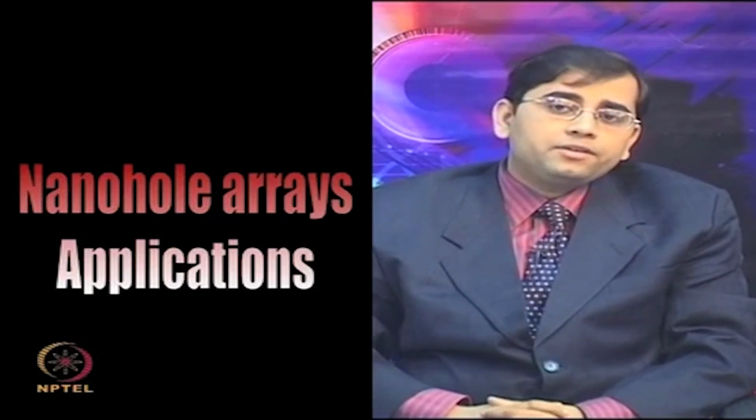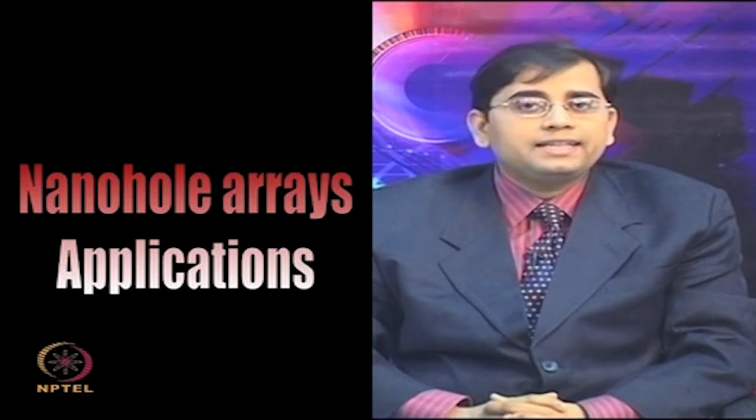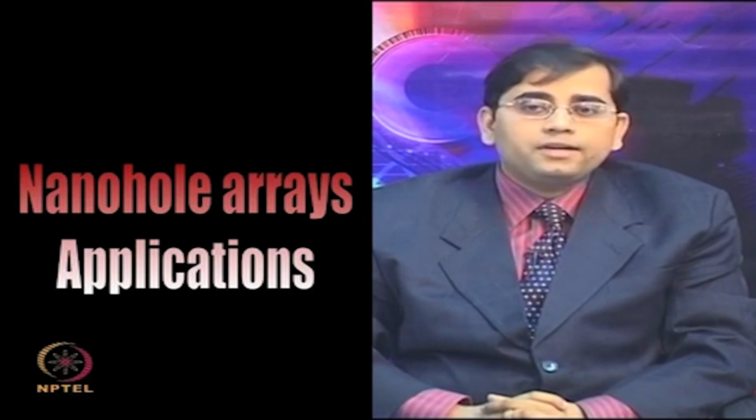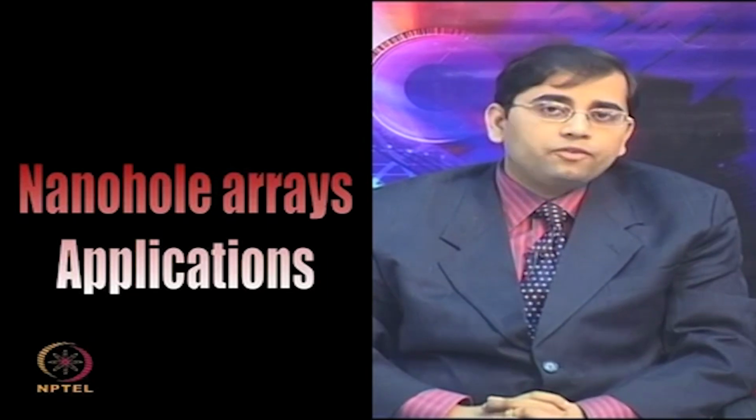Now, let us discuss a few of the nanohole array based applications. The simple optical alignment, easy miniaturization, very small footprint, very high sensitivity, multiplexing capability and collinear optical detection make the nanohole arrays a very useful platform for various applications. Nanohole arrays are promising for high throughput protein microarray based applications. They have been used for binding kinetics measurement, biomarker screening, as well as studying protein-protein interactions.